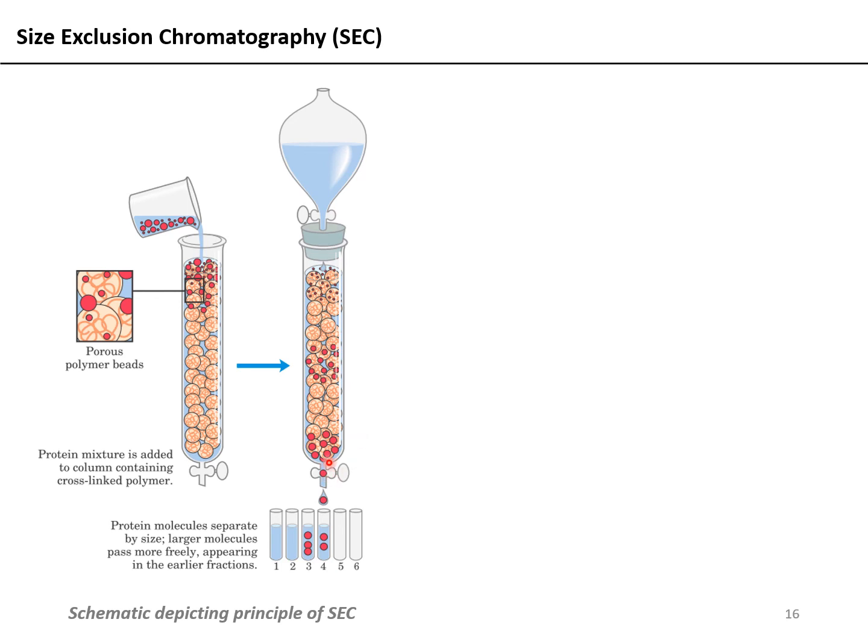Now, for SEC, a term that is very commonly used is void volume. So what do we mean by it? Those molecules which are above a certain size will not enter any pores at all, and they will simply pass through the free spaces within the column, and these molecules are said to go into the void volume. And for those molecules which have to undergo resolution, they have to enter these pores.